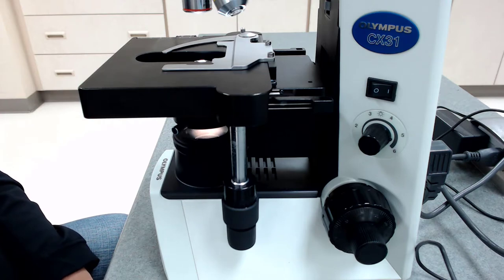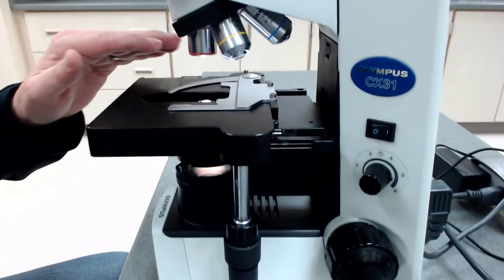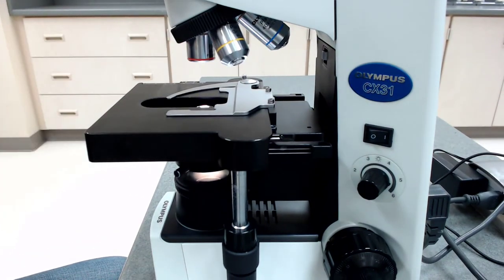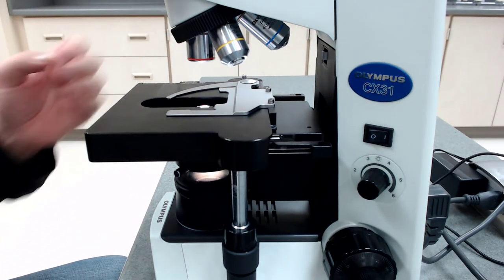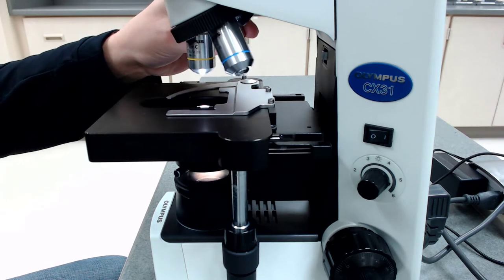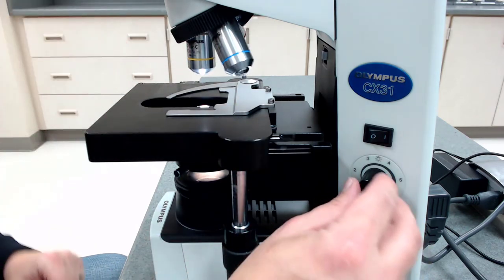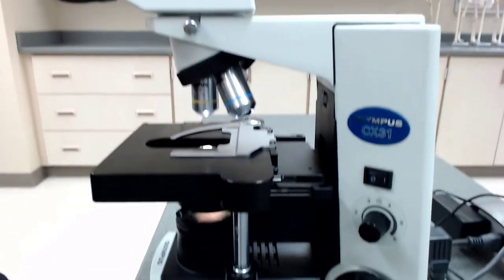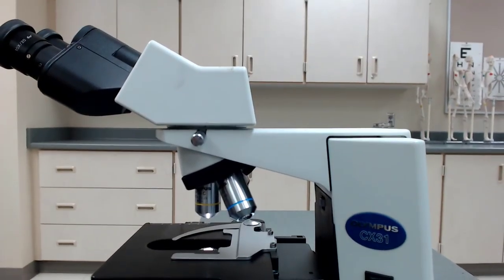But so a compound microscope has a multiple lens system. And that's not these different objective lenses here. We're actually using multiple lenses at the same time. So let's say we switch it here to this low power, the 10x objective.